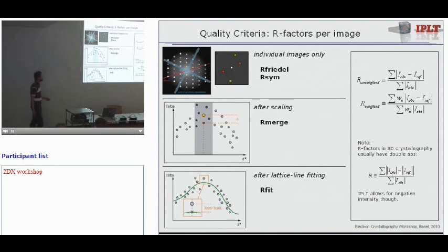And there, you can compare these and use the same formula, using as a reference the other symmetry related points to get a symmetry R sim, which gives you some information on whether this pattern really fulfills that symmetry. One thing is also that this is dependent on the tilt geometry. So if the tilt axis is off, R sim will also be off.